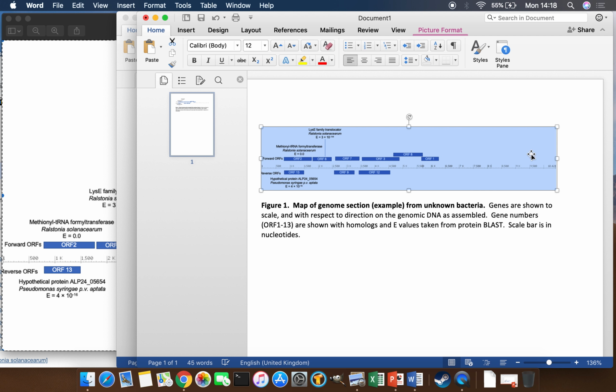There's just no genes in mine in the last about 4,000 nucleotides of that thing, which is, I don't know, that makes me suspicious. Makes me think that this bit is misassembled, or there's something wrong here. Something didn't quite work out right, but I don't know. And it's not your job to figure out what went wrong. It's your job to do your best version of annotation on these.